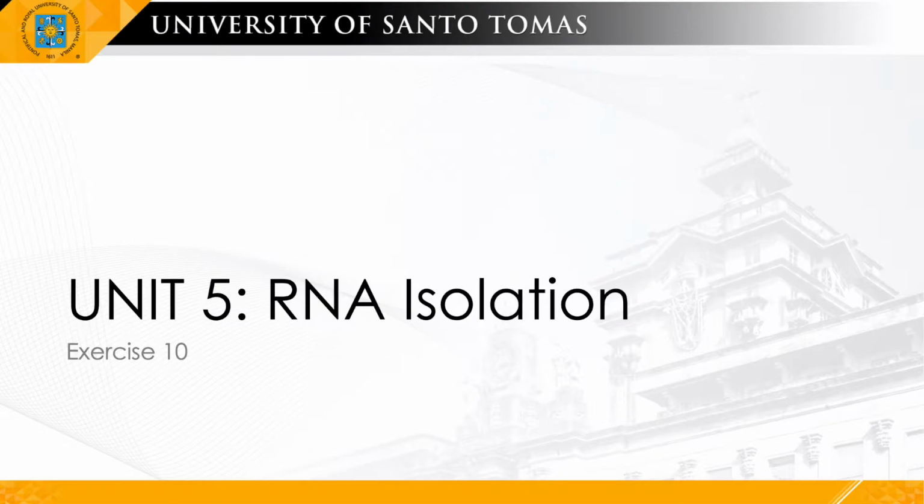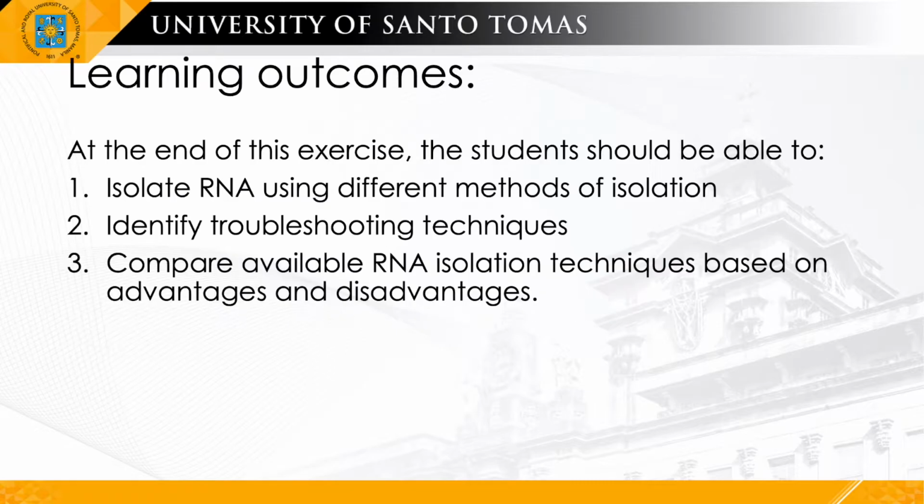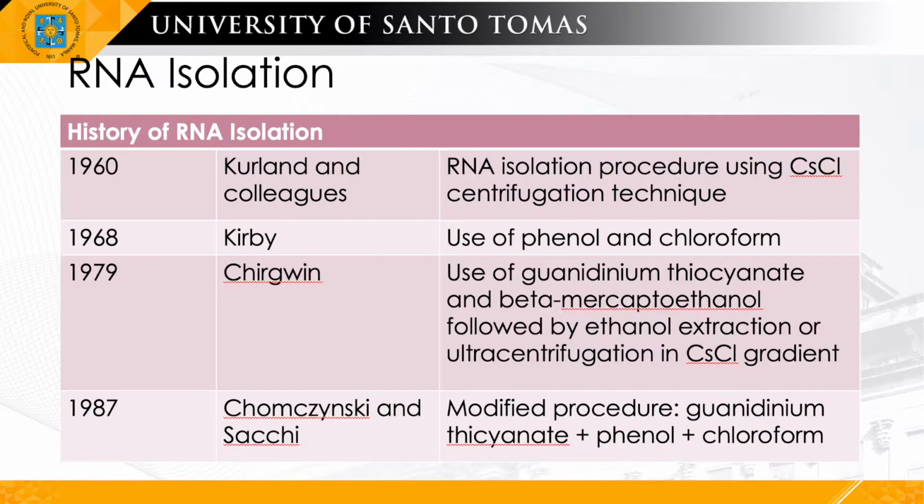So now let's go to RNA isolation, exercise 10 of your manual. Again, the learning outcomes for today will be isolation of RNA, identifying troubleshooting techniques, and comparing available RNA isolation techniques based on their advantages and disadvantages. But before we go there, let's do a bit of history.